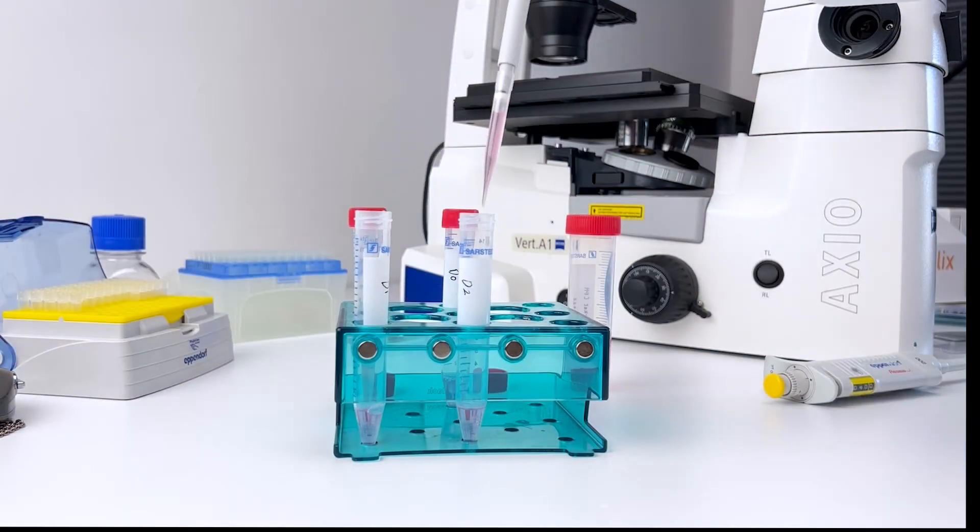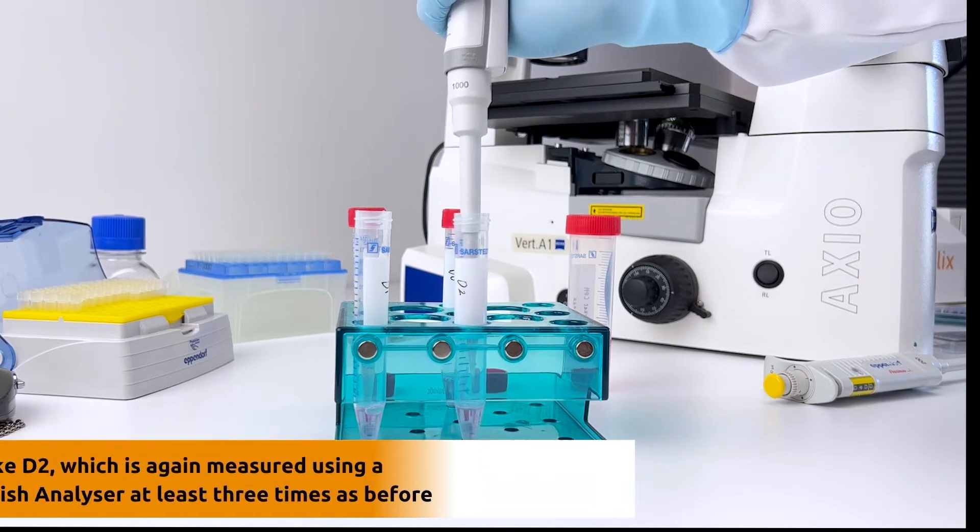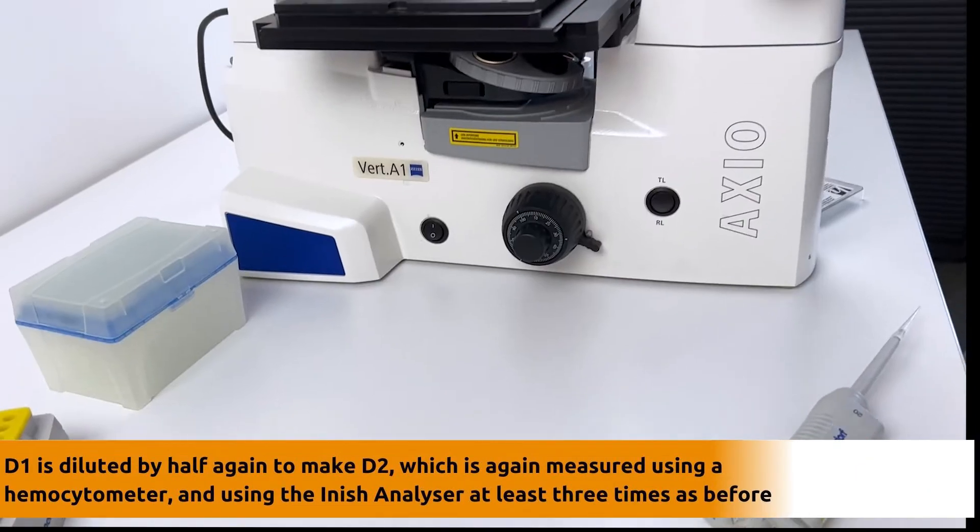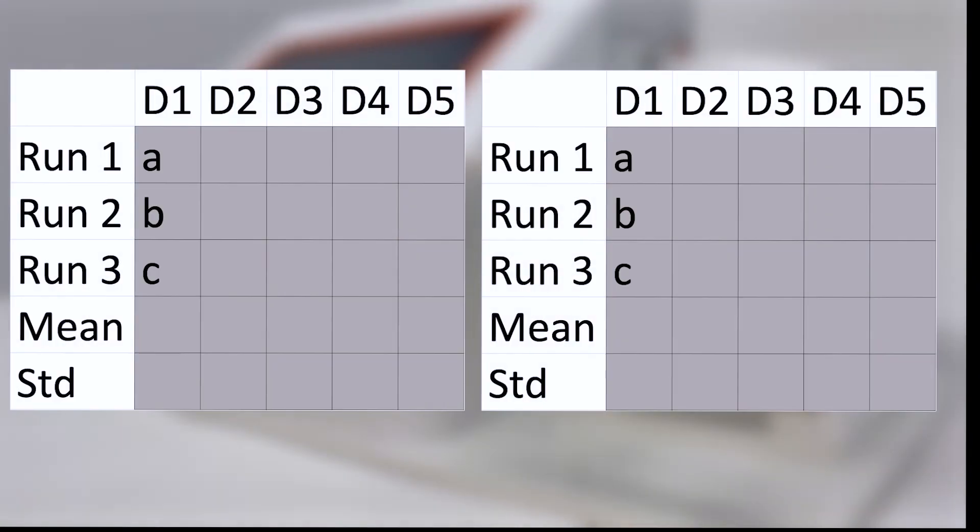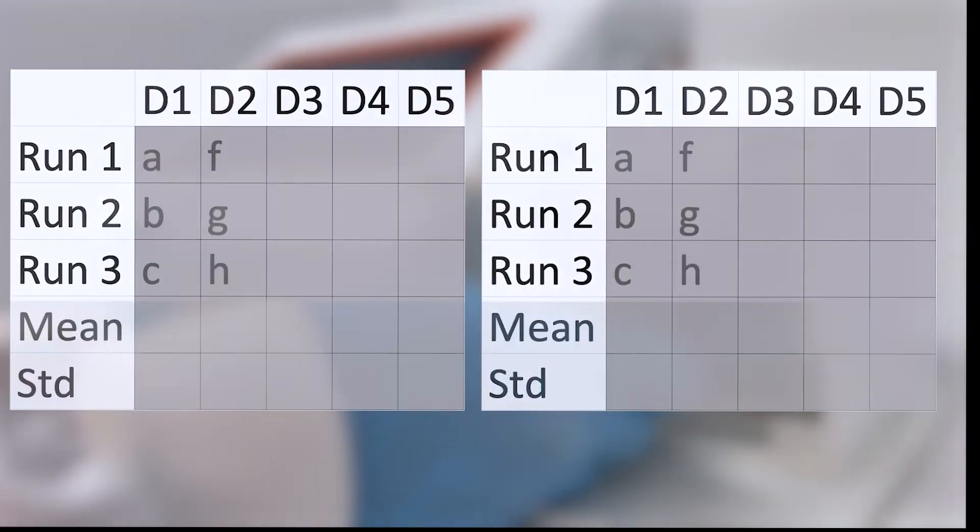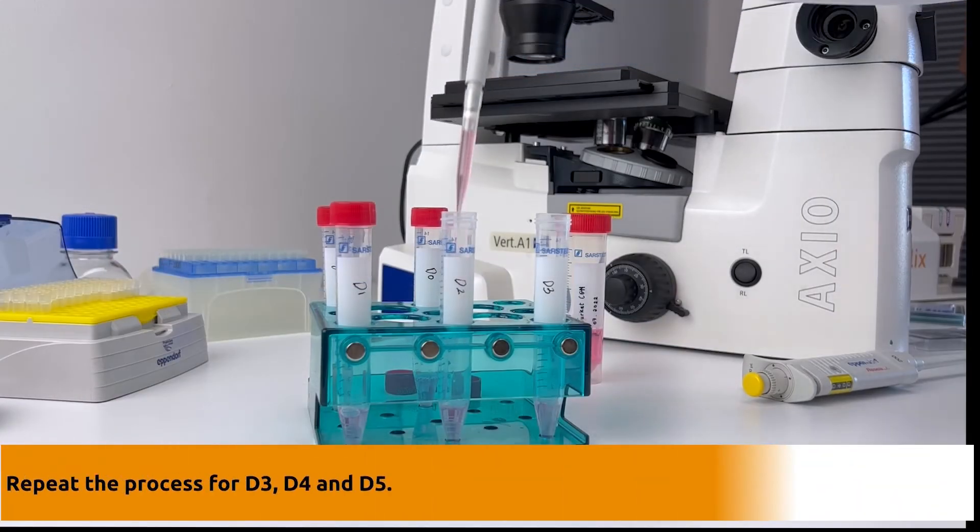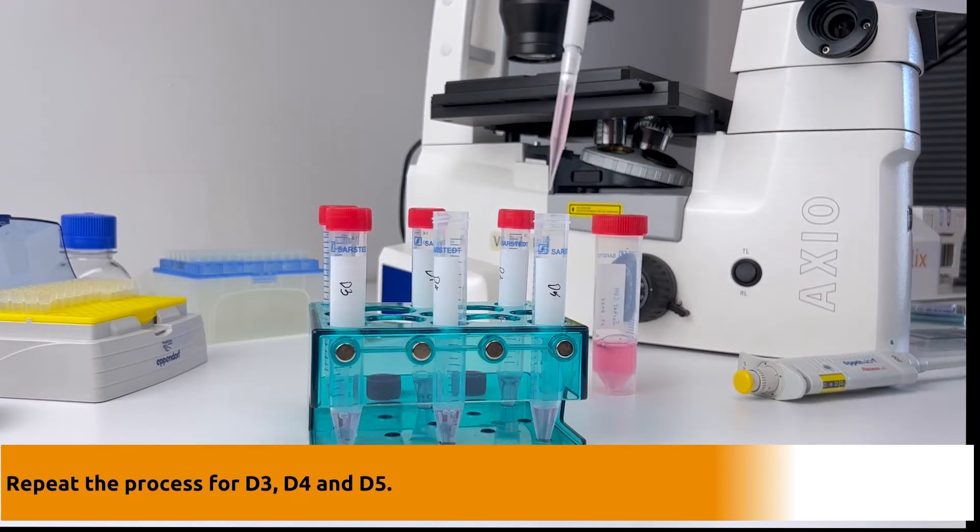After taking your measurements, D1 is diluted by half again to make D2, which is again measured using a hemocytometer and using the Inish analyzer, at least three times as before. This whole process is repeated for D3, D4 and D5.